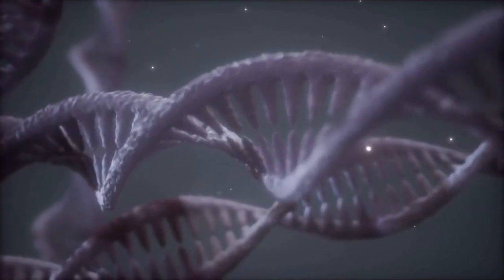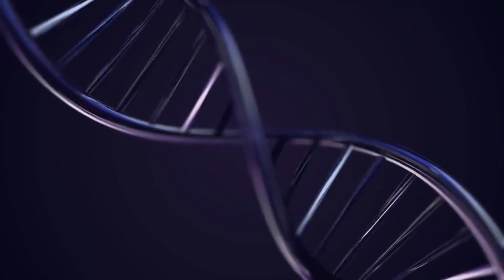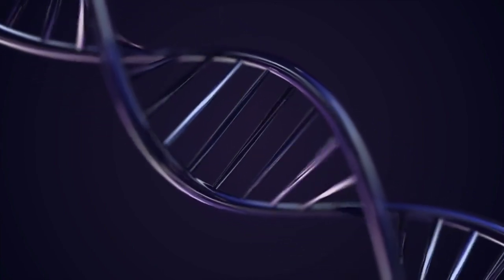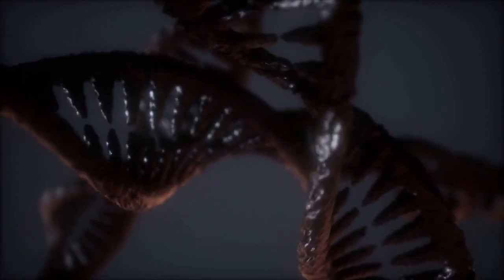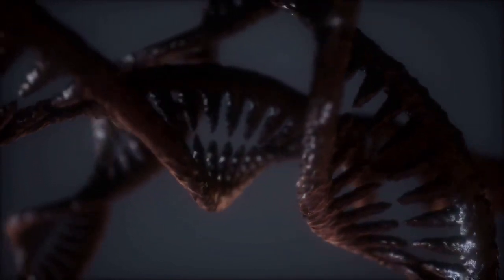Finally, photometry is crucial for working with DNA and RNA. These molecules naturally absorb ultraviolet, UV, light at a specific wavelength. By placing a DNA sample in a UV spectrophotometer, we can instantly measure its concentration and even assess its purity, a vital step for experiments in genetics and molecular biology.